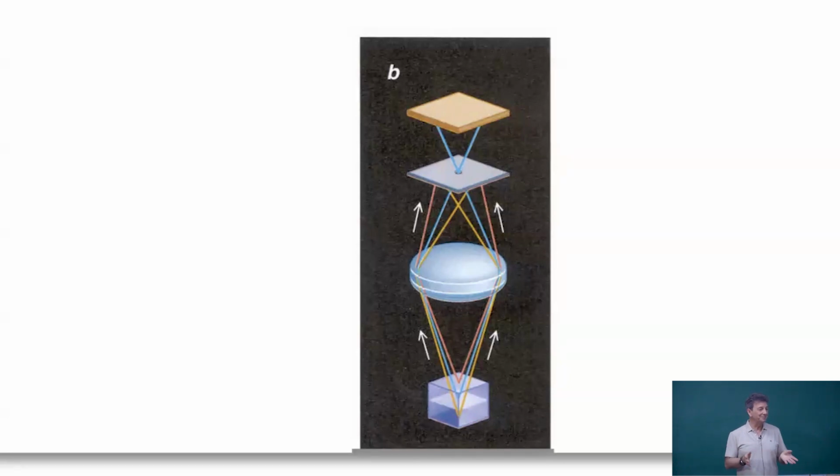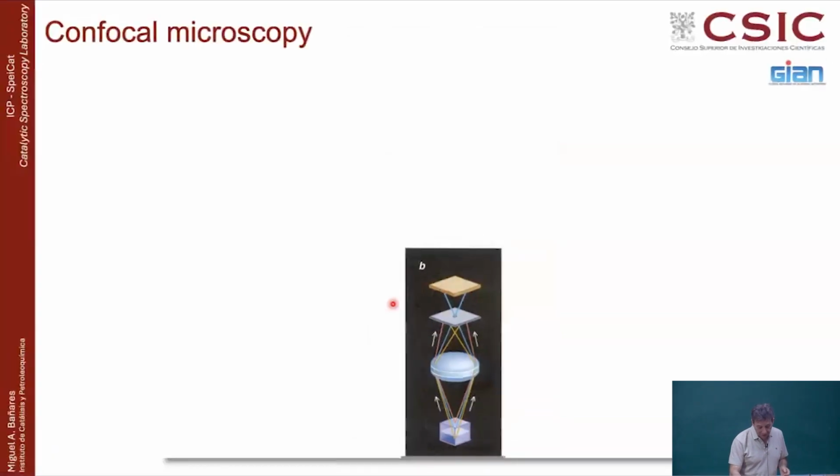Do you know Superman? Okay, you know that they say he has X-ray vision? It's wrong, he has confocal vision. Because X-ray vision will go through all the building outside. They say X-ray, but this is confocal. But it's special. On planet Krypton it works like that, but over here we are limited to a few microns.